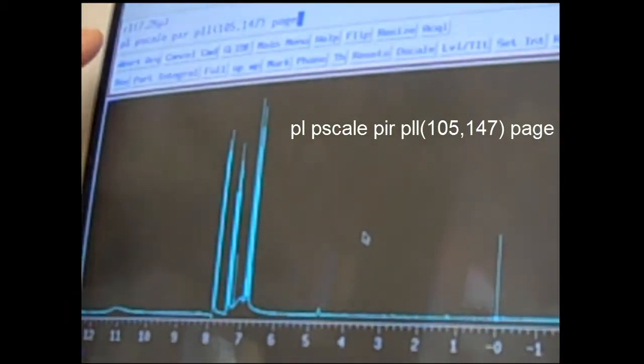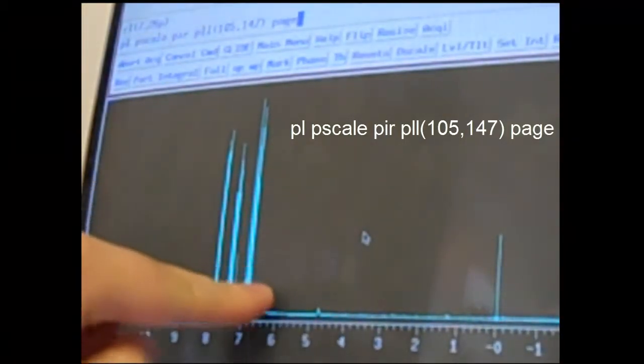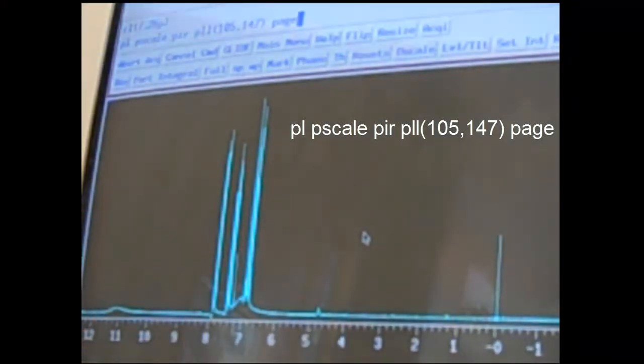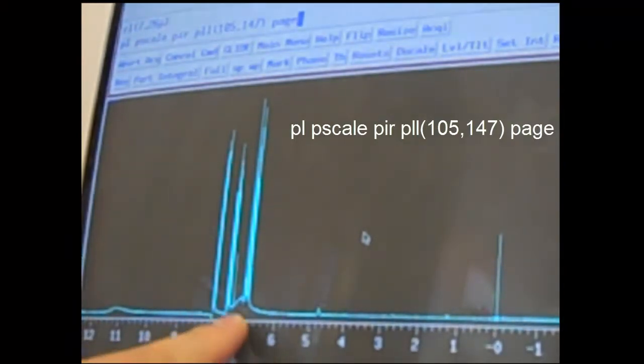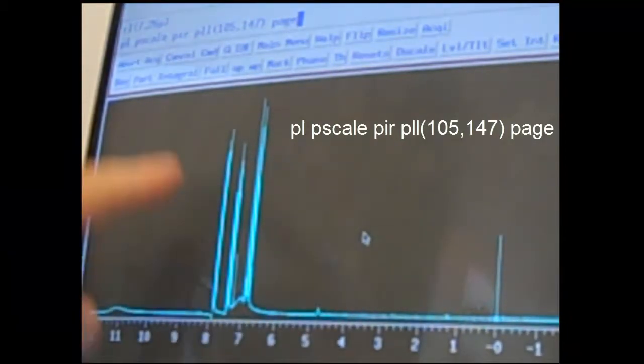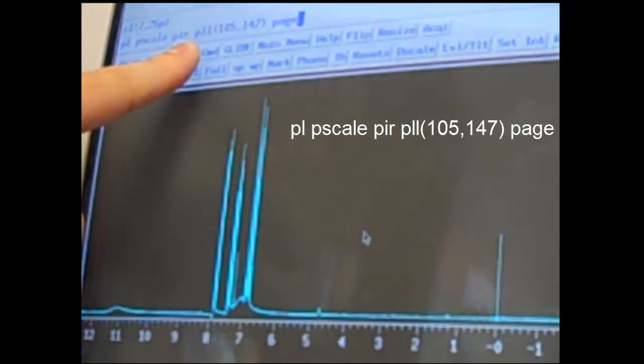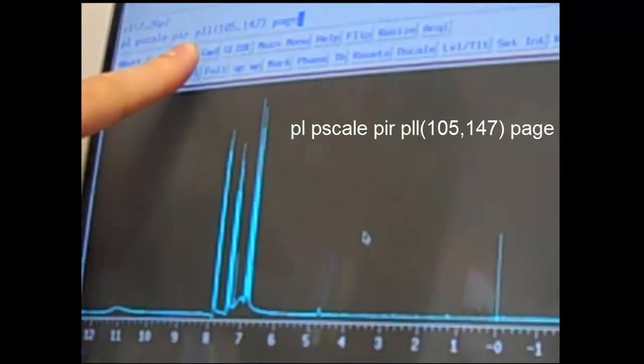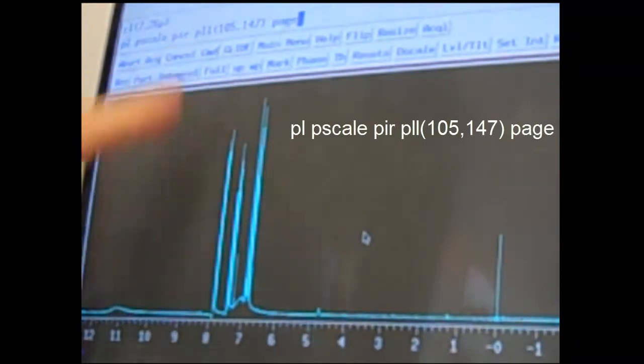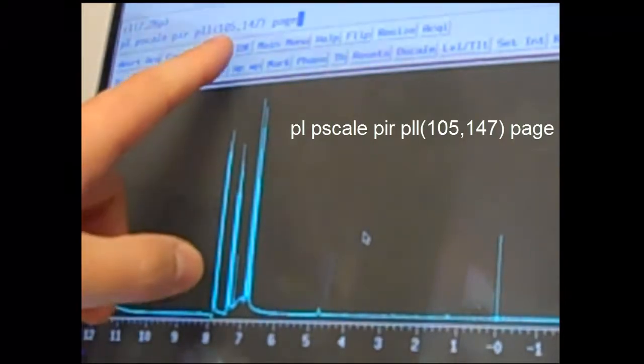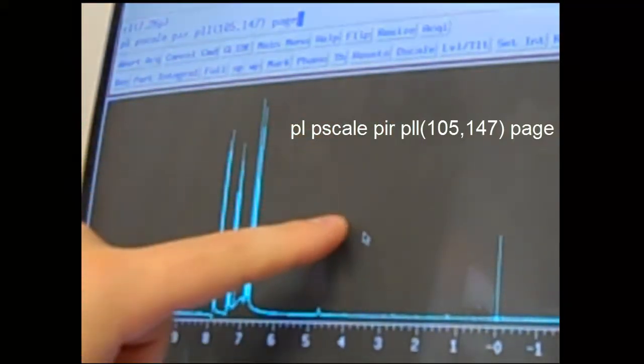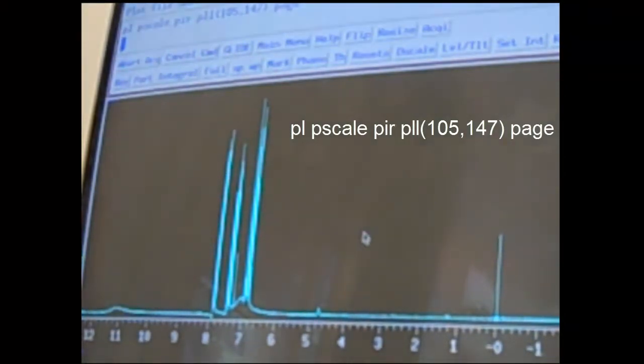The PL means print line. That's the actual NMR trace. PScale means print the scale. PIR means print the integration values, which will show up as numbers giving the relative area values underneath the peaks. PLL105147 prints out the peak table. Remember that threshold, the yellow line. Anything that was a peak above that yellow line will print out in a table. 105147 is just the location on the screen of where that shows up. The PAGE sends that to the printer and will print out your spectrum.